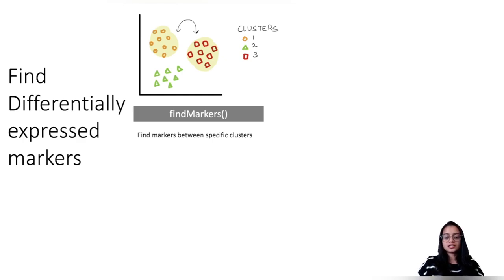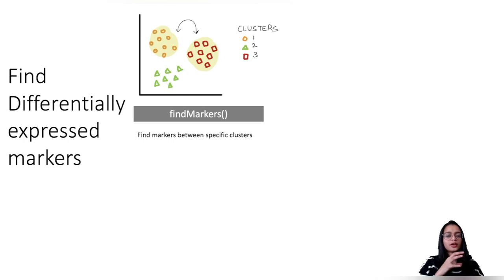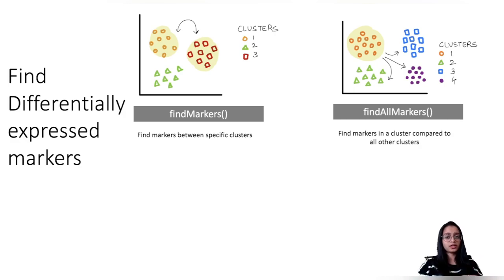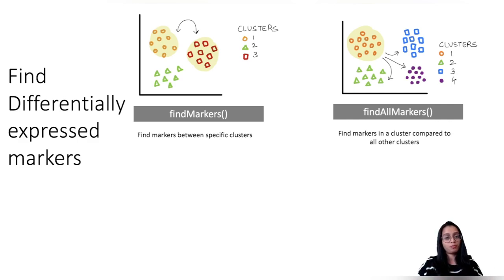The next question you might ask is: I want to identify the cell types in my clusters — what is the identity of each cluster? In that case, it makes sense to identify markers that are highly expressed for each cluster. You would essentially want to compare each cluster versus all the other clusters. When you want to make such a comparison, FindAllMarkers would make sense because it iteratively compares one cluster with all the other clusters and gives you the genes that are differentially expressed, helping you identify what cell types form each cluster.